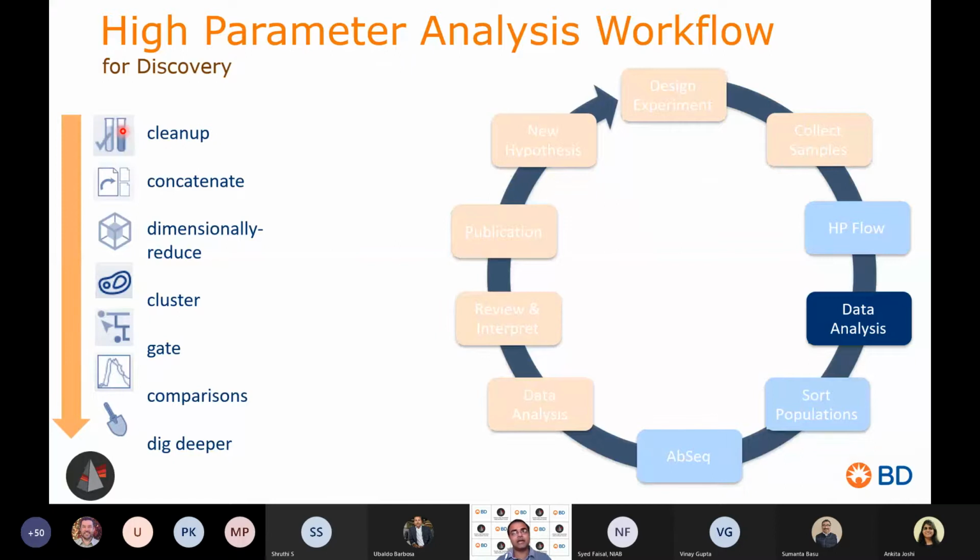And finally, if time permits, we can have a small session with a live demo of how to install R. Then we will end today's session, and you will have an assignment that you can practice, because all of you have a license to FlowJo now, and we have a set of instructions and 5 FCS files which we will give you for practice purposes. You can follow those instructions and let us know how it works.